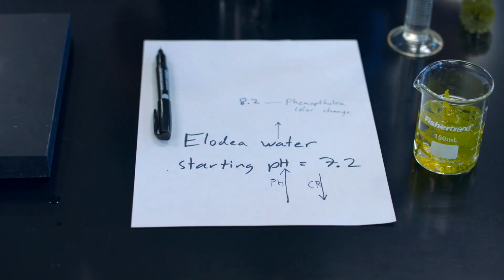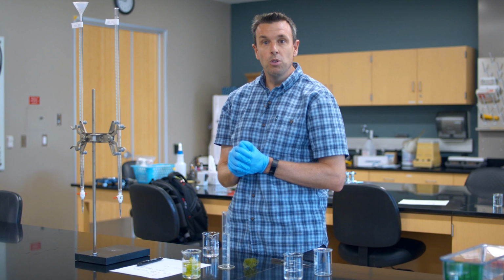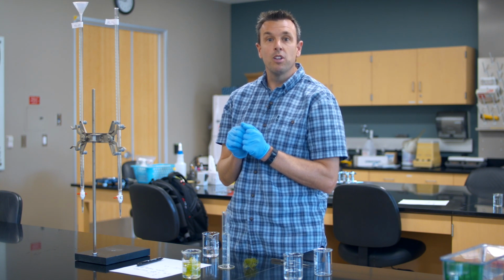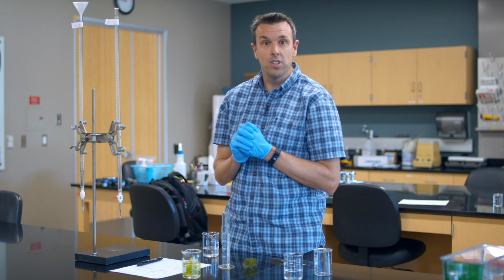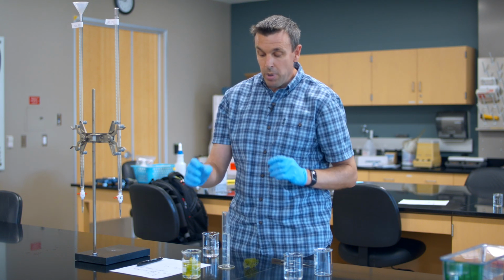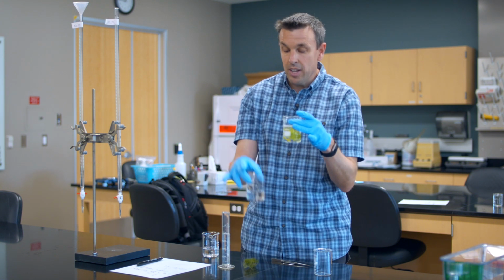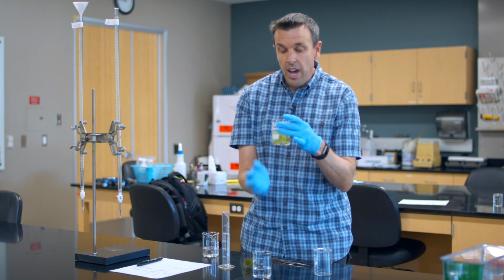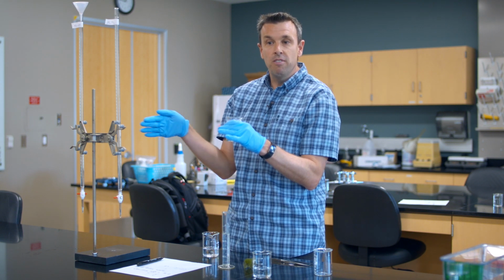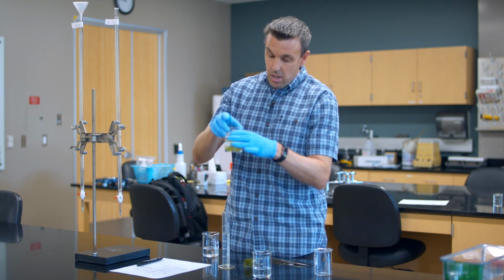So this is where your designed experiment comes in. You're going to design an experiment that we're going to do where you're going to create a hypothesis about what you think will cause more or less photosynthesis in the Elodea plant. And so we want to then compare. We're going to have several beakers. We're going to have a control beaker that has no plant. We're going to have a beaker that's in the dark, only doing cellular respiration, and then beakers that are in various conditions that you've decided.